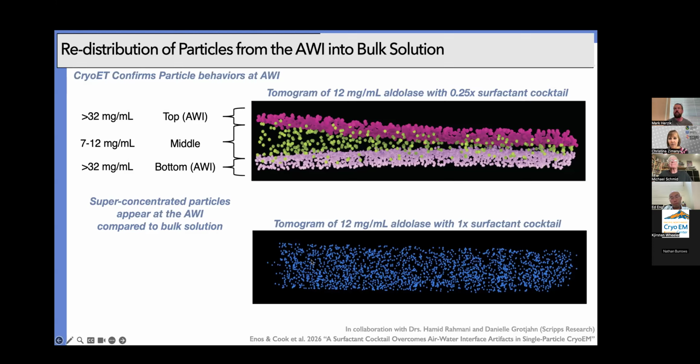But we do know from one sample that was filamentous that it worked just fine. And the caveat there is that the filament lengths of this sample varied substantially, from maybe a few hundred angstroms to thousands of angstroms. But we didn't get biased viewing or anything crazy, at least with that filamentous sample.